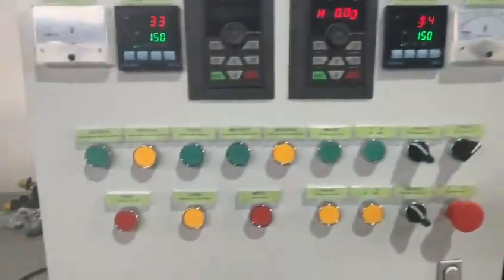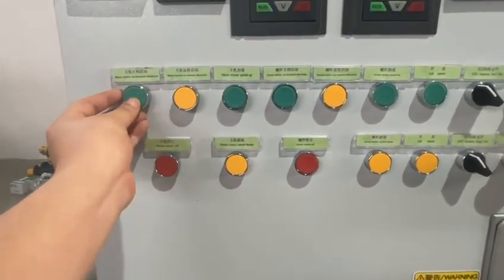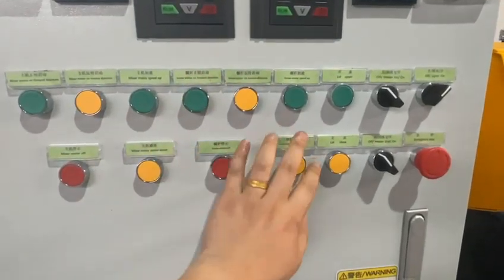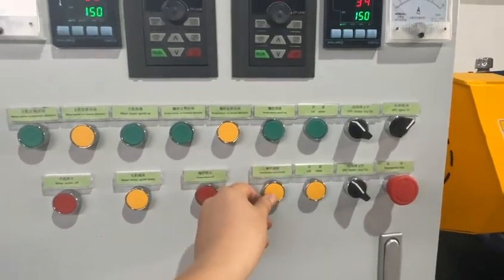Now we test the double Sigma blades part: forward, reverse, stop, speed up, speed down. This is the screw discharging part: screw discharging, screw reverse, stop, speed up, speed down.